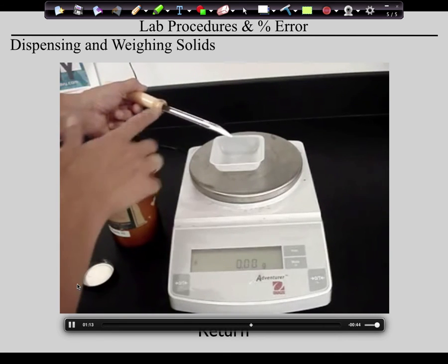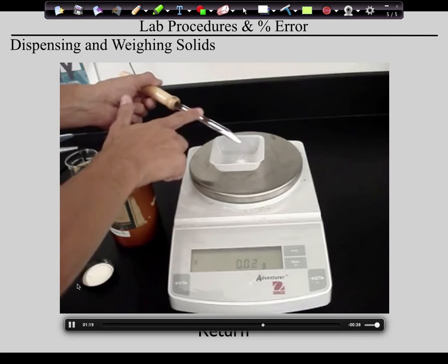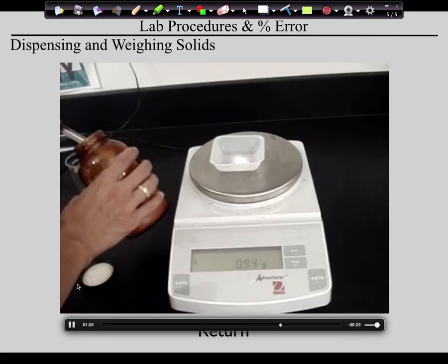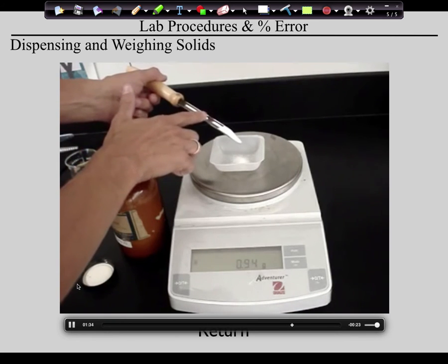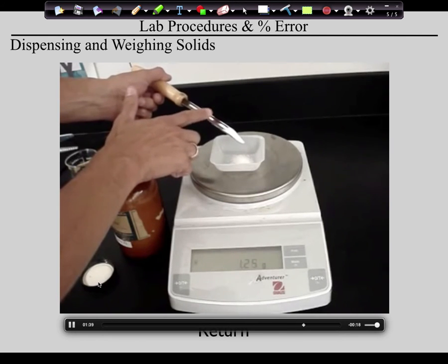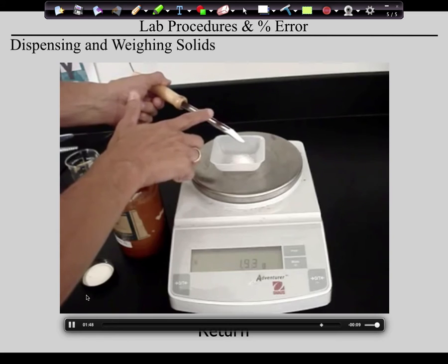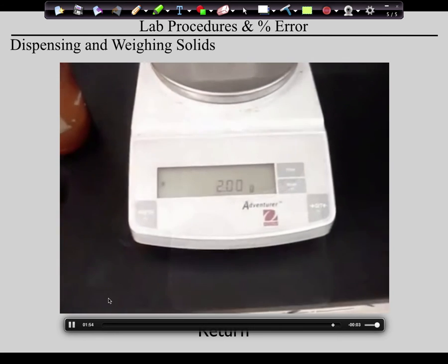And so what I use is what I call the tap method. Notice if I just slowly tap on this spatula, it just slowly puts an even amount in. Now if I want 2 grams, I can watch the balance there and get an idea that I'm not very close yet. And so I'm going to need about another one of those scoopfuls. And notice I'll, again, just lightly tap on this, making sure all of the sugar, in this case, goes in the pan. And I can just slowly watch it ease up to my 2 grams. I have very good control. I can just get a couple grains at a time in this way. And we'll just slowly ease up to 2 grams.